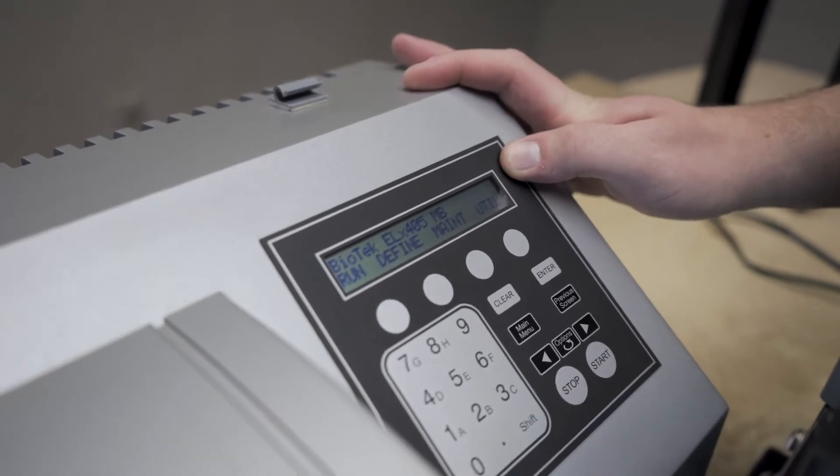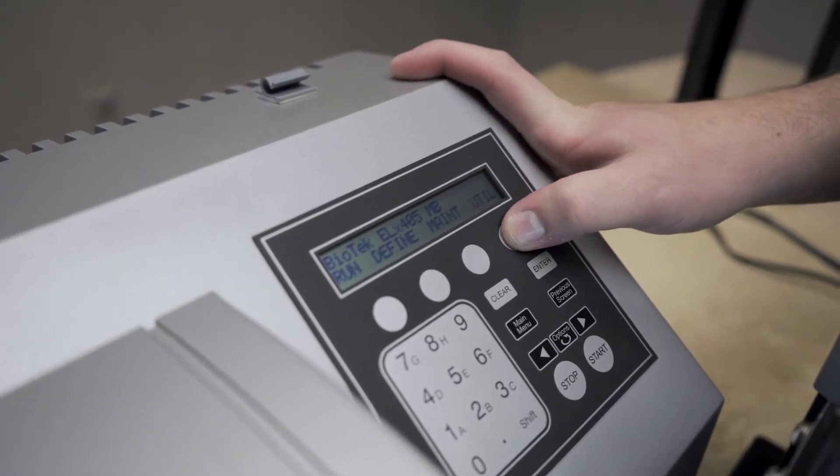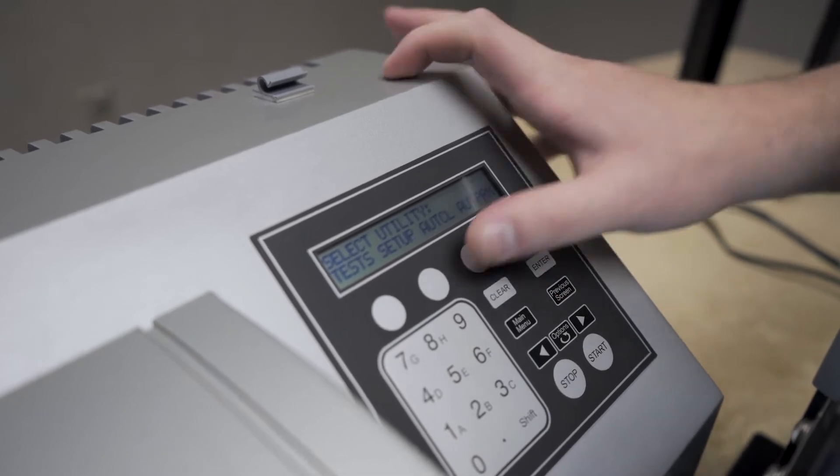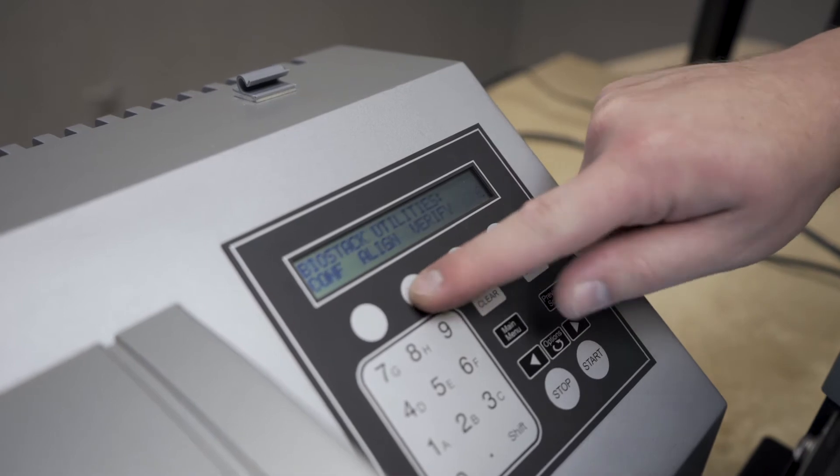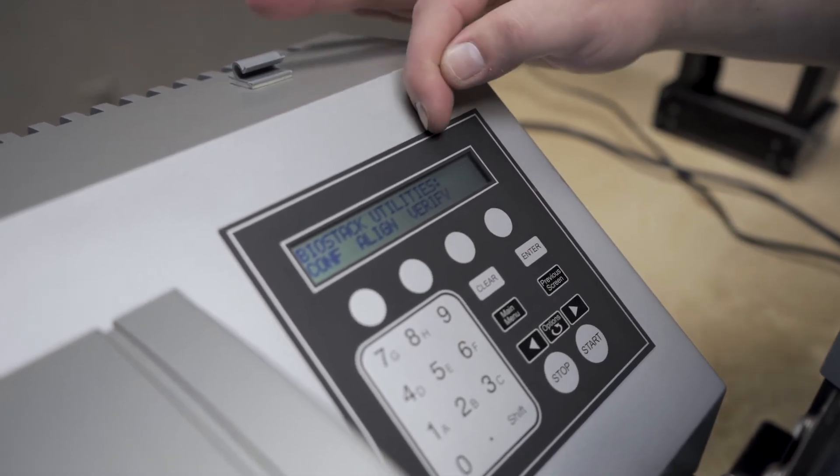To access the BioStack alignment utility, we'll have to go into the utilities menu, setup option, scroll over to more, and BioStack. From here, we have a config, align, and verify.